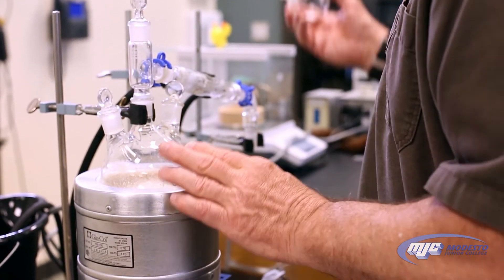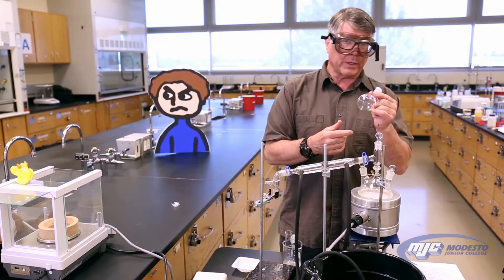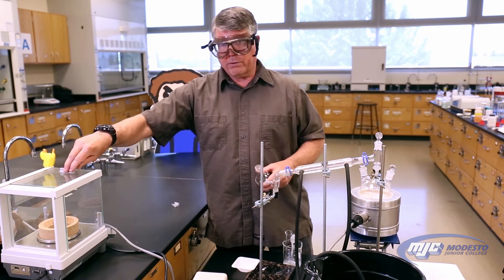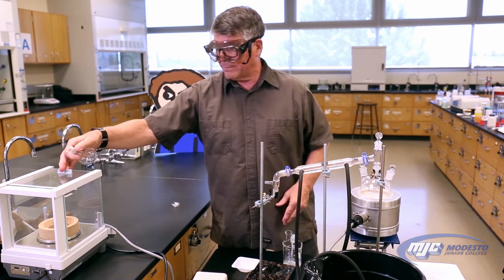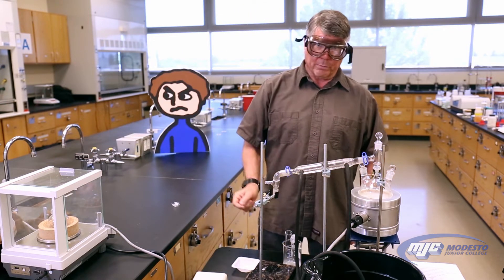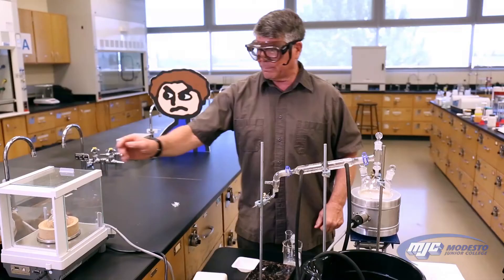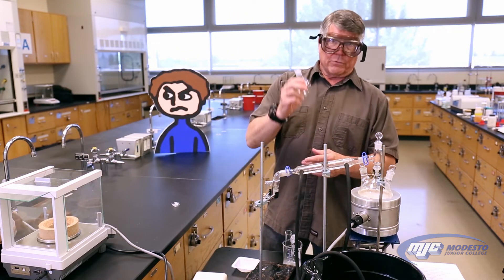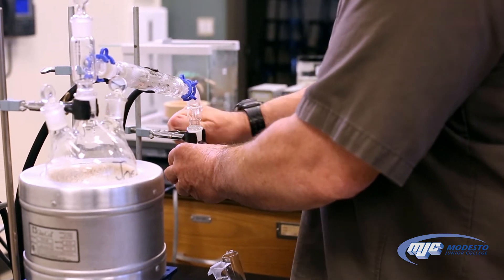Before we can turn this on, we're going to collect the distilled water in this 100 milliliter round bottom flask. We need to know how much it weighs because we're going to weigh it with the water at the end. The cork ring is still on there, so I'm going to tare the balance — it says zero with the cork ring on there. That's the mass of the 100 milliliter round bottom flask, which is A3. Three places past the decimal, little g for grams. I'm going to attach the 100 milliliter round bottom flask to the output of the condenser and hold it on with the test tube clamp.